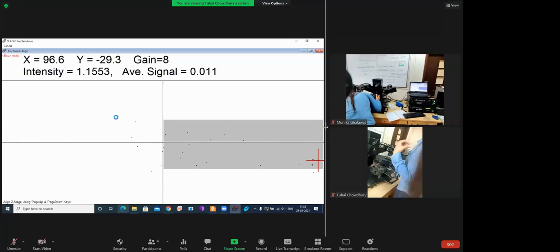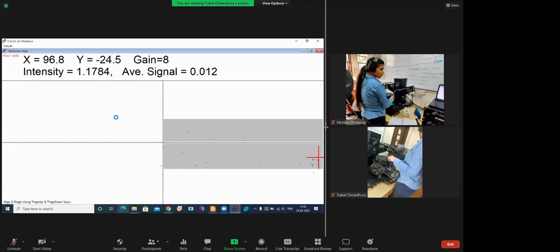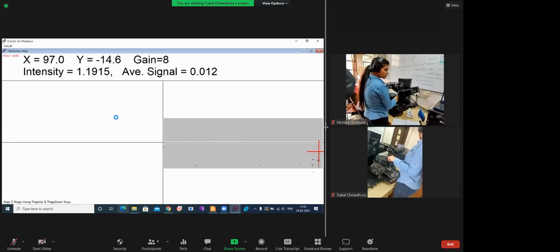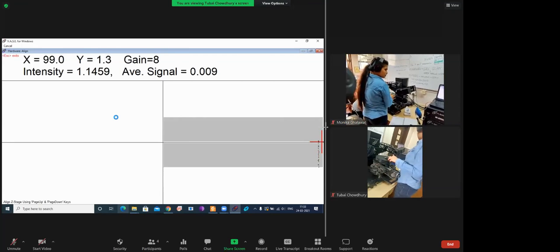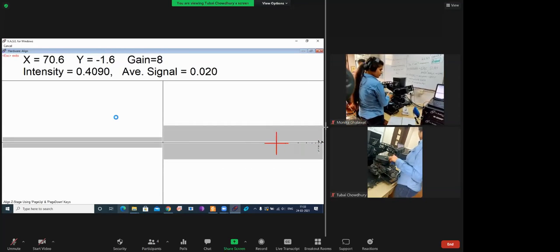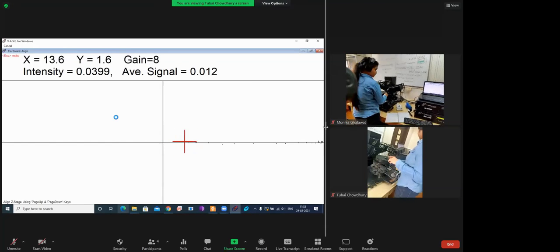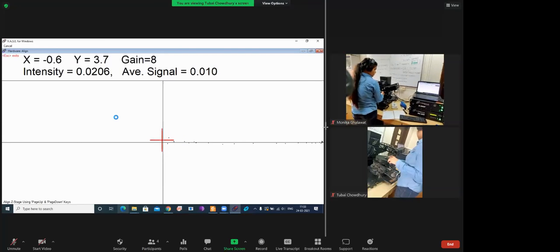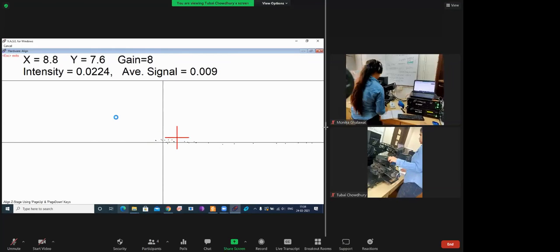Okay, it's inside. And now we have to make sure that plus is coming at the center. Since it's not optically smooth, it will create some issue for us. But if you have an optically smooth substrate, you can go for it. The area is okay.